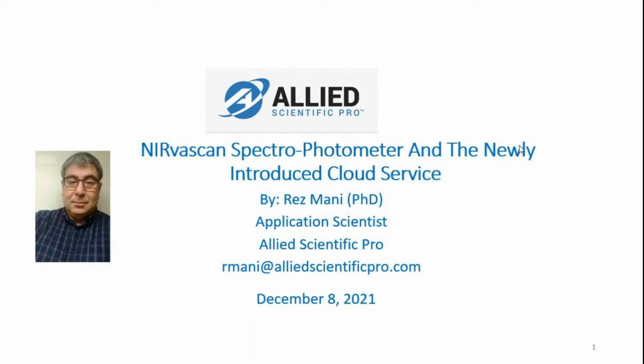how to use different features of the PC software and the app, and also we'll be talking about the cloud. So it's some kind of an instruction about how to use the cloud and what the different features mean.